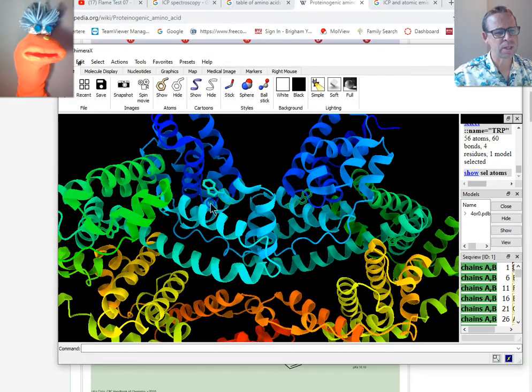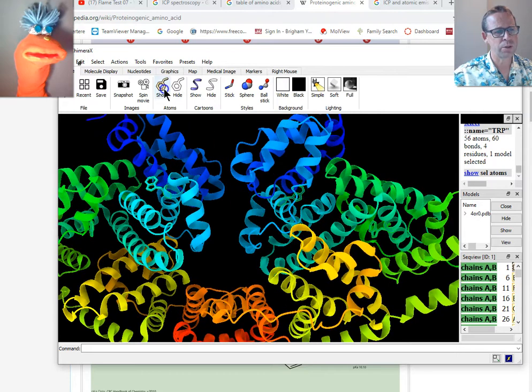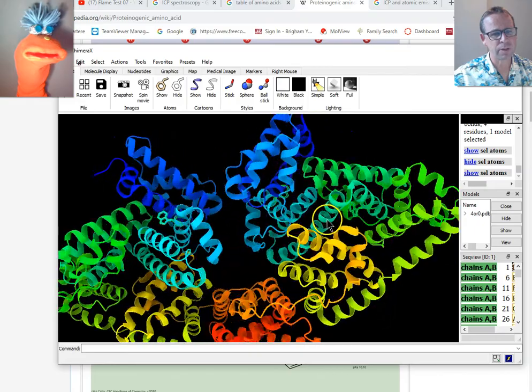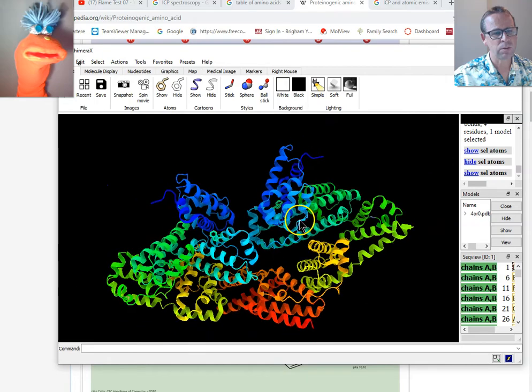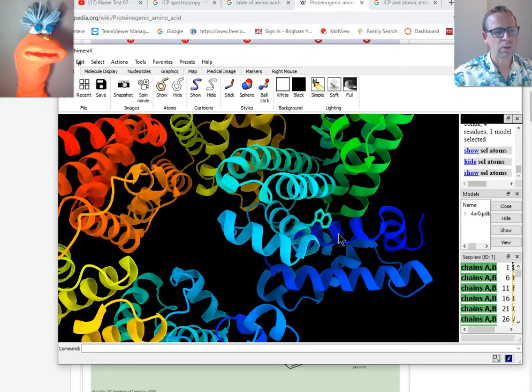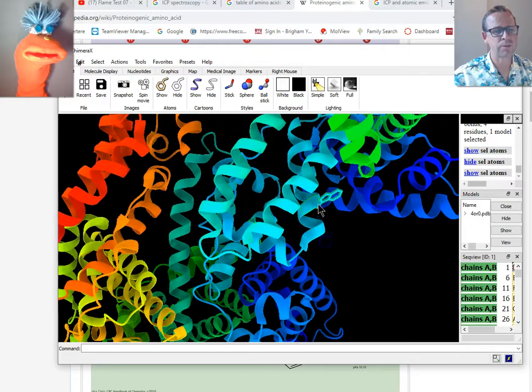See, here's the side chain of a tryptophan. So what I did was I selected all the tryptophans and said, show their side chains for me, right? So I could hide them and then I could show them again. So we can see where the tryptophans are, right? So it looks like we have, is it just 2 tryptophans? All right, so one here and one here. Okay, this one here is pretty close to the surface. It seems to be a real good access to the surface there.